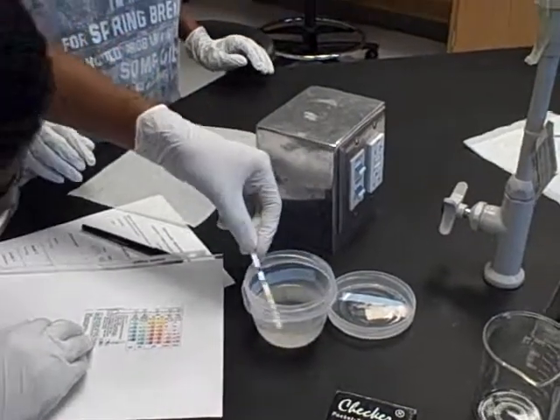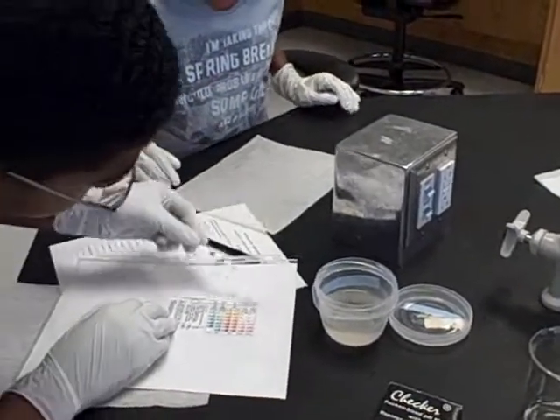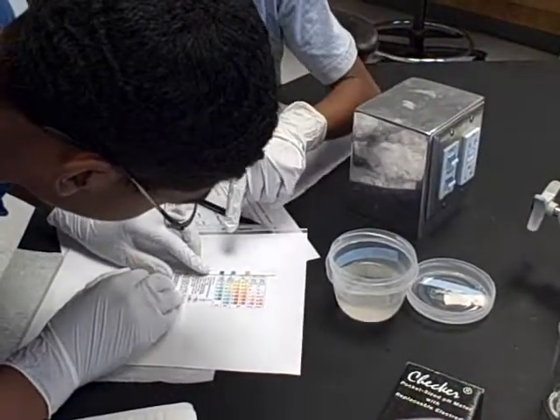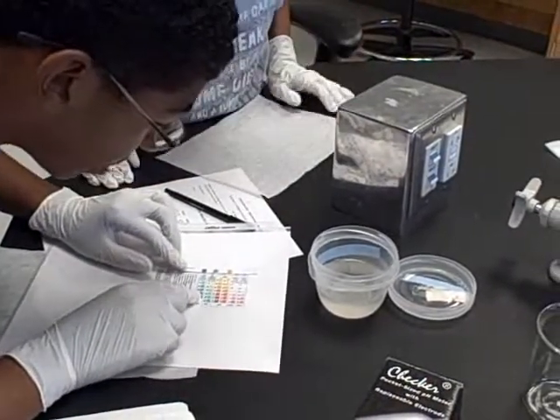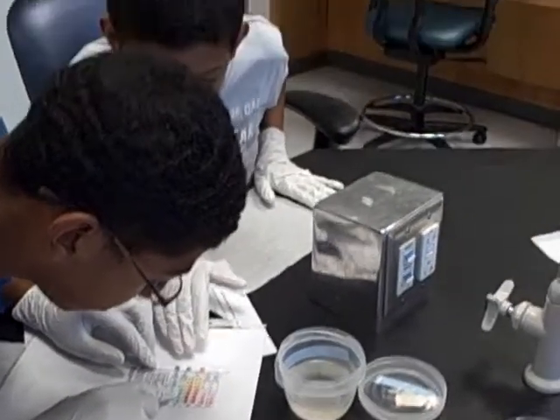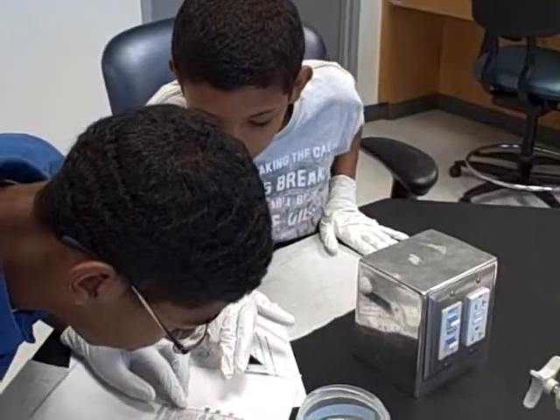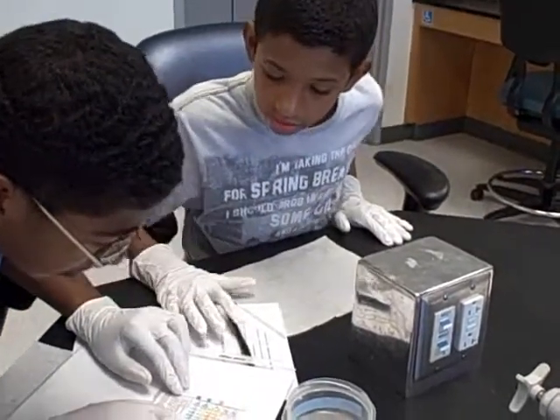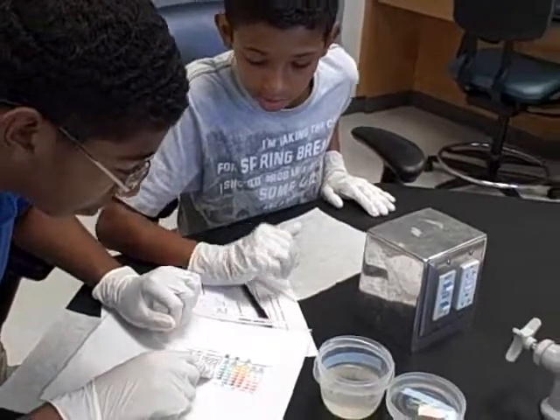Alright. Yeah, you say it's about the last one. Yeah, and then 120, the general hardness. And then this is 240. 240. And then wait 30 seconds for those to.